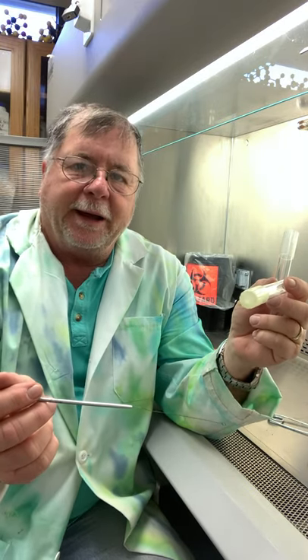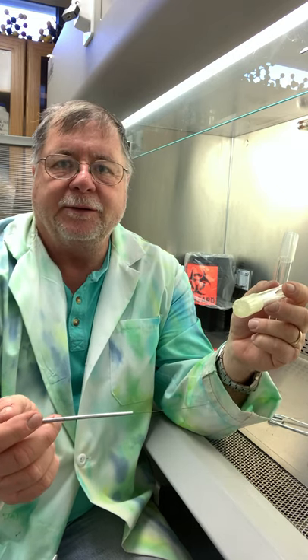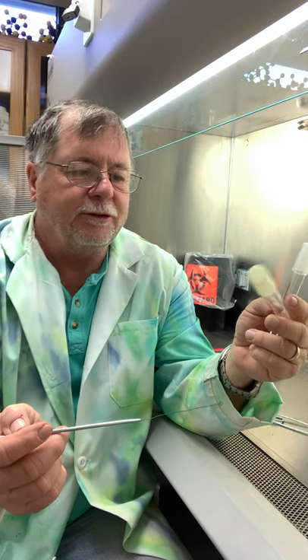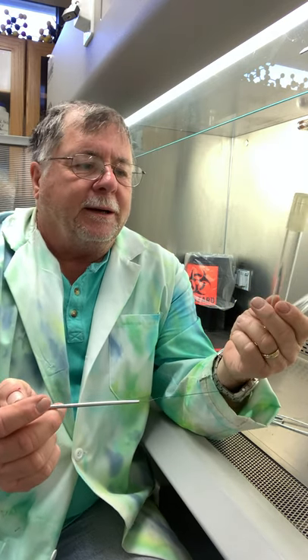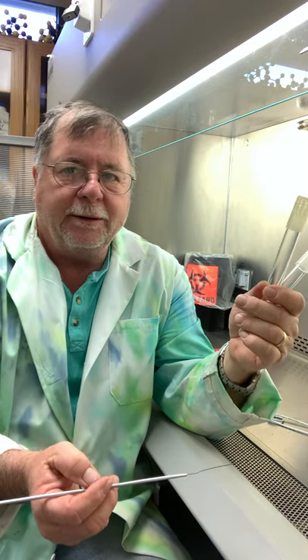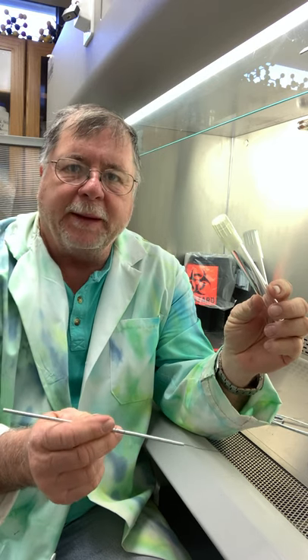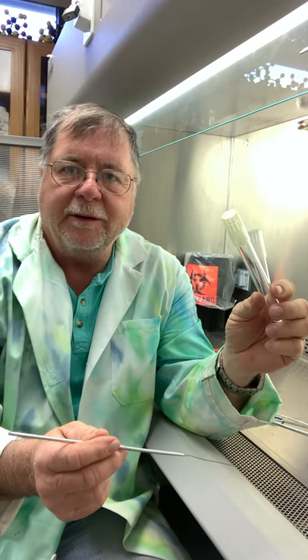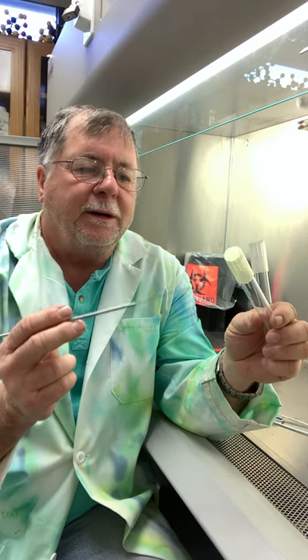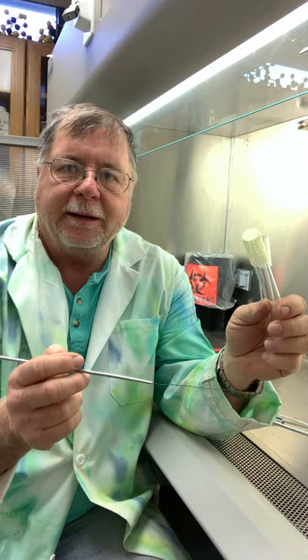And so if it's a pathogenic bacteria, then you have to deal with that. It can be quite a lengthy decontamination issue. But in our labs, we would be working with bacteria that normally do not cause disease in healthy adults. And so these are biosafety level 1 conditions.